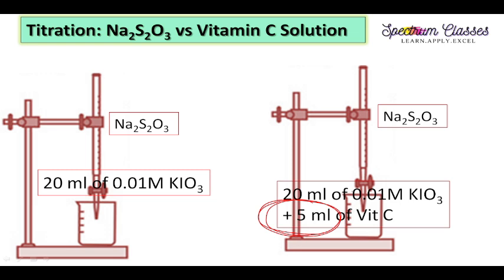Now what do you expect is going to happen? Say 20 ml of this solution, and similarly 20 ml of this solution again. The same thing is repeated over there. Now I have additionally added 5 ml of vitamin C solution, which I distinguished with a light yellow color.